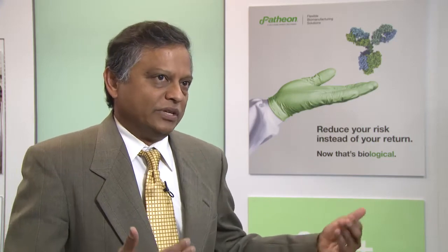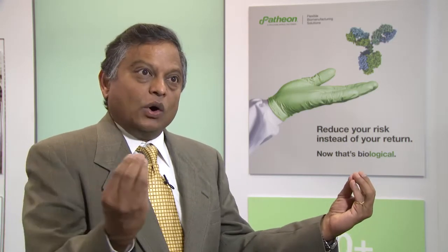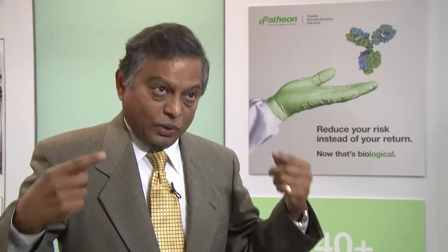And of course, this requires a change in thinking from a typical downstream processing aspect. Instead of doing batch chromatography, for which you need to store material before and store material after, if you can switch to a continuous chromatography, you will have no or very minimal requirement of a holding tank between the different processing steps. And therefore, bottlenecks can be an issue if the flow of material has not been thought through well.